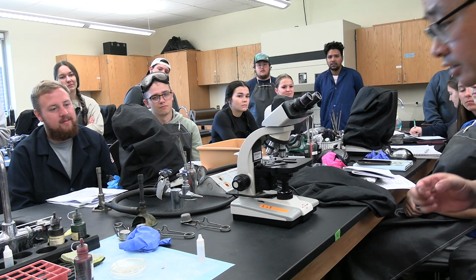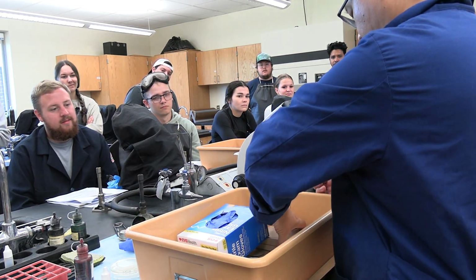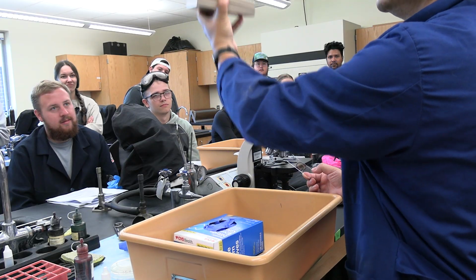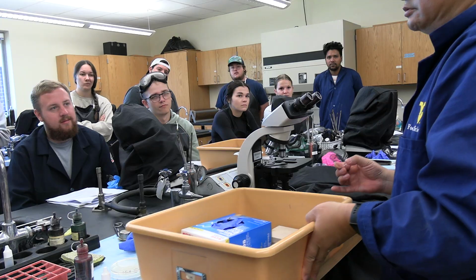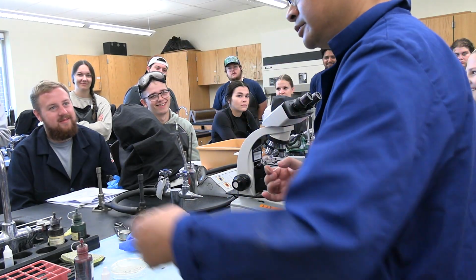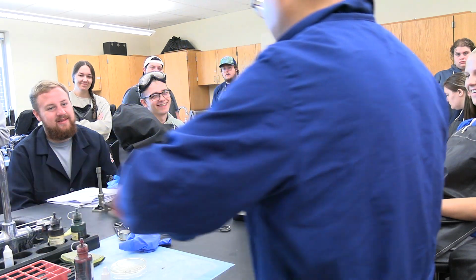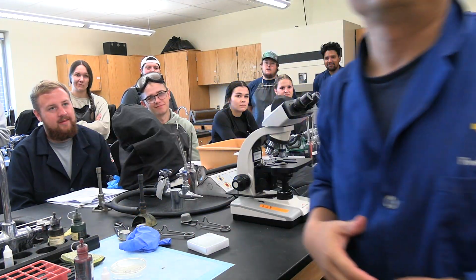Put it on your own box right here. You don't have to throw them away. You can clean it and put it in your box right there. Okay. Then next time when you gram stain, you can use it. You don't have to throw them away because we have a limited budget for all of these things. It used to be you could just throw it away, but you can keep it. Okay. So I left this one as my demo.